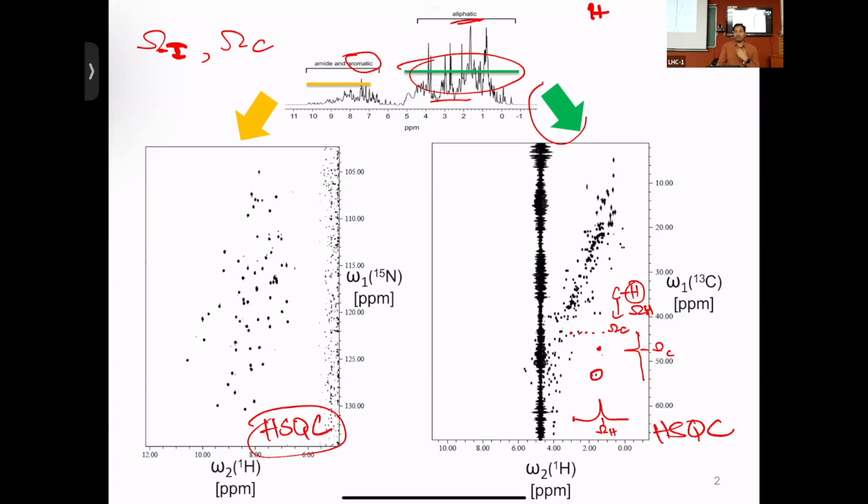We have to make sure that if I take up BPTI, the spectrum should look like this. If Jeet takes up BPTI and works in his lab, the HSQC should match. So this is a fingerprint for the protein that will not change at all, and therefore we are sure our samples are all the same. So he can continue to do the studies that he wants, and I can continue to do the studies that I want. And if Vinesh takes it up in Trivandrum, the spectrum cannot change just because we did it in different parts of the world. It has to report the same thing. So the nitrogen-proton HSQC is one of the most important experiments that's run.